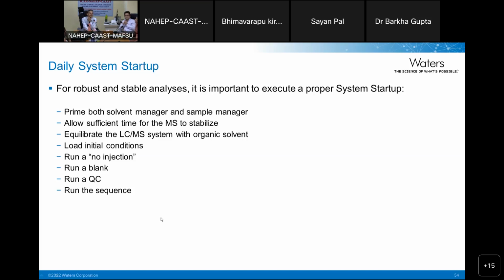Common thing is the contamination. Her question is, the QC is performed, say, at intervals in a sequence. After, say, every 10 injections, they are performing a QC, and the QC response is going down over a period. So we are facing a sensitivity issue, a decrease of sensitivity.